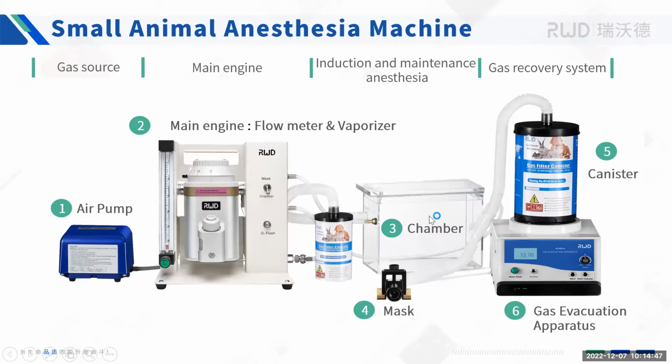This picture is for the whole system. And when you connect the system up, you can use this picture. We can see it consists of these parts: the gas source, flow meter and vaporizer, and then the chamber and mask. Finally, is the gas recovery system.